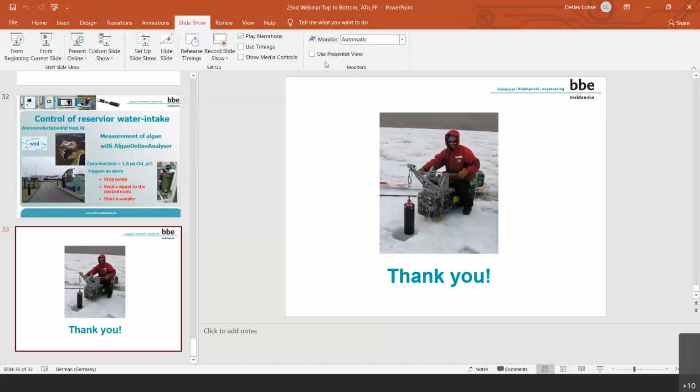The minimum detection limit, as we determined it in our laboratory under ideal condition, was 0.017 microgram per liter. It's a very small amount, but this is ideal condition in the laboratory. I think at, let's say, 0.1 microgram per liter under natural condition, it works quite well. The FluoroProbe has a photomultiplier inside, which makes this instrument very sensitive.